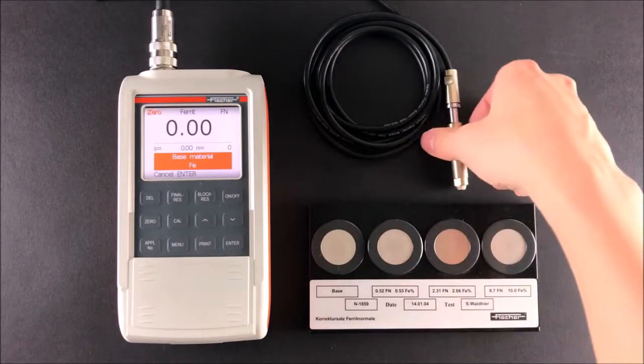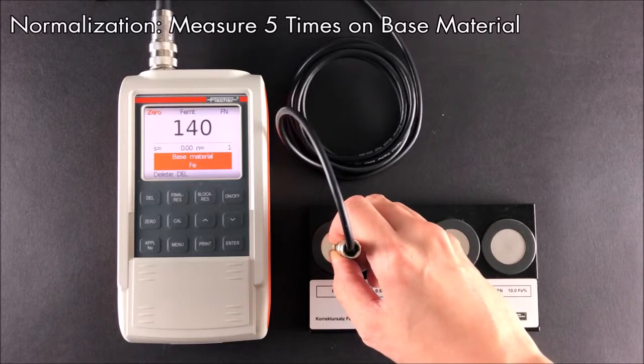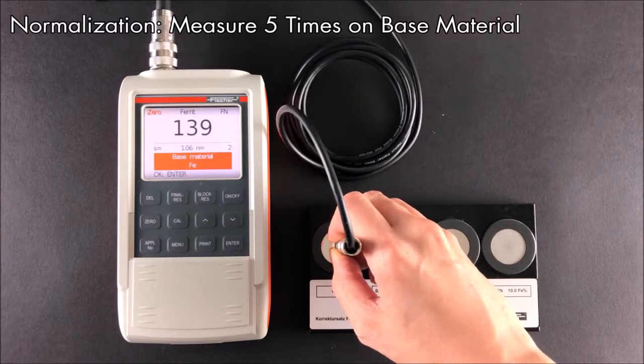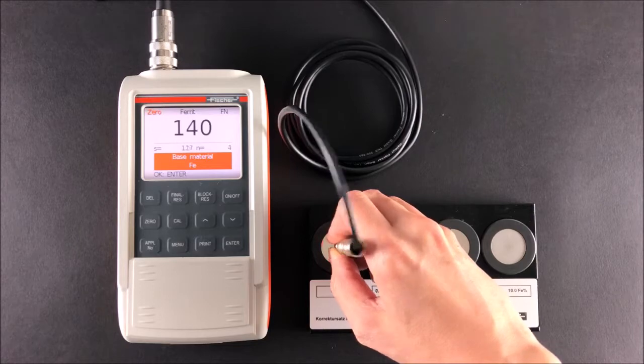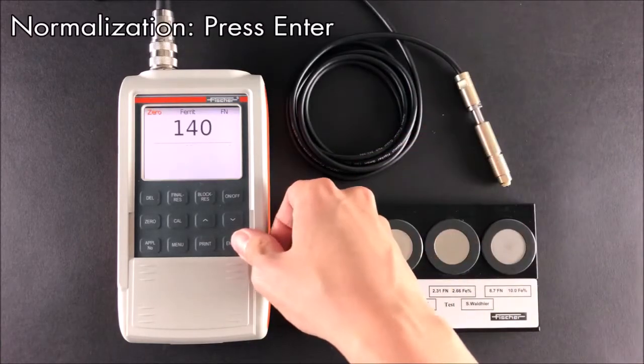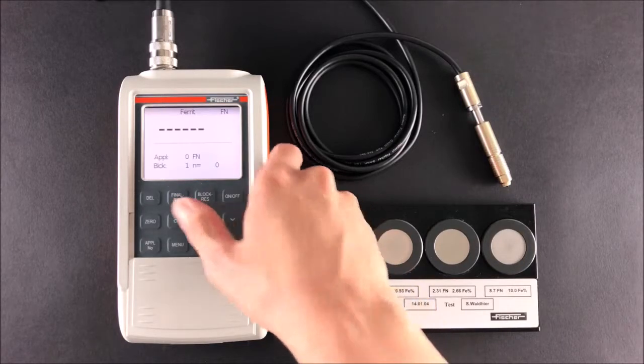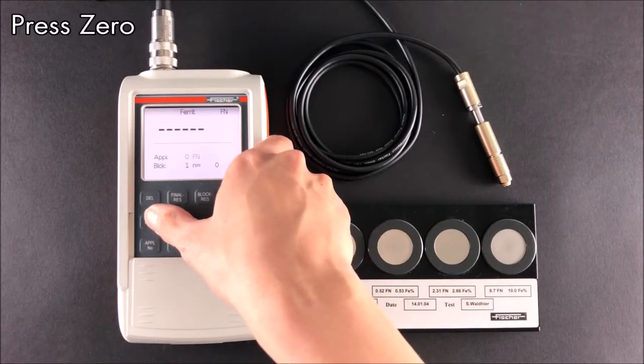Following that, the instrument will initiate a normalization. Measure the base five times. The normalization is complete. If you would like to perform the normalization again, press zero and repeat the same steps.